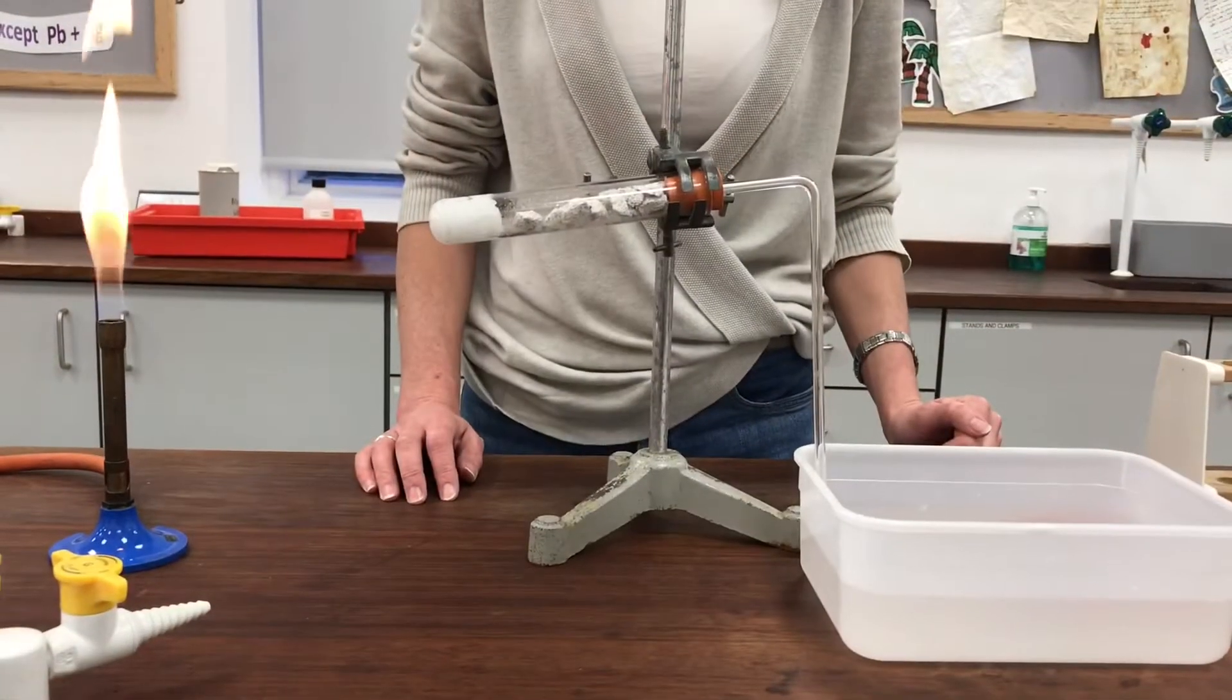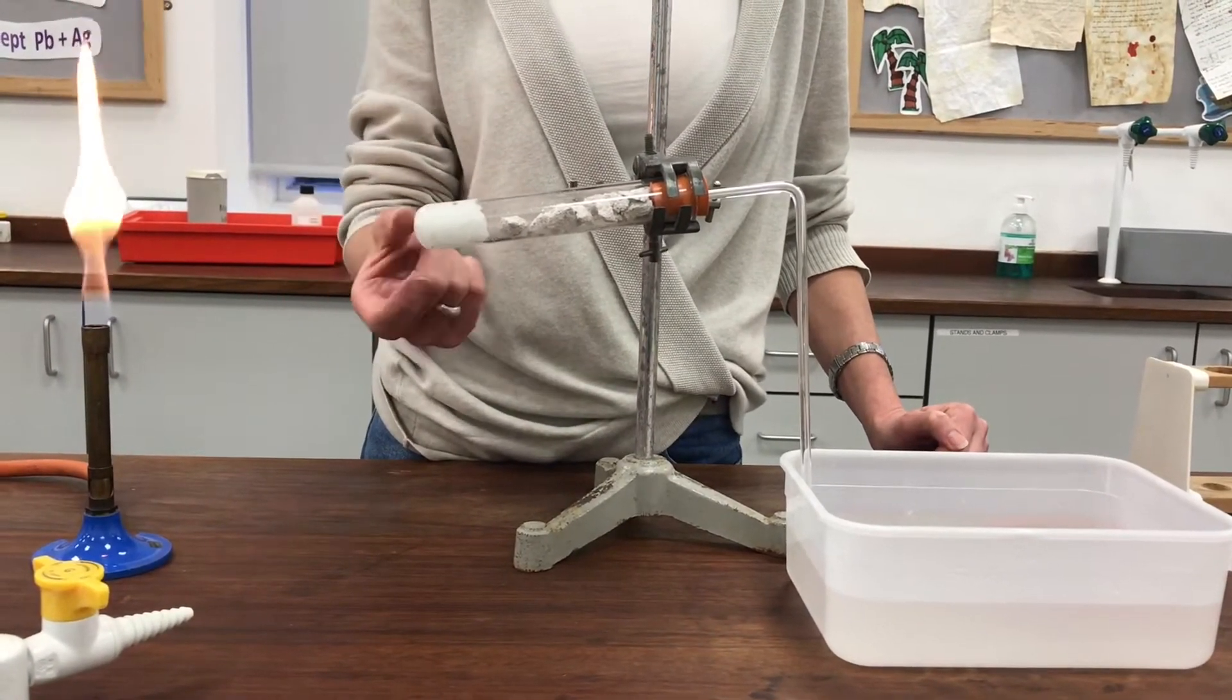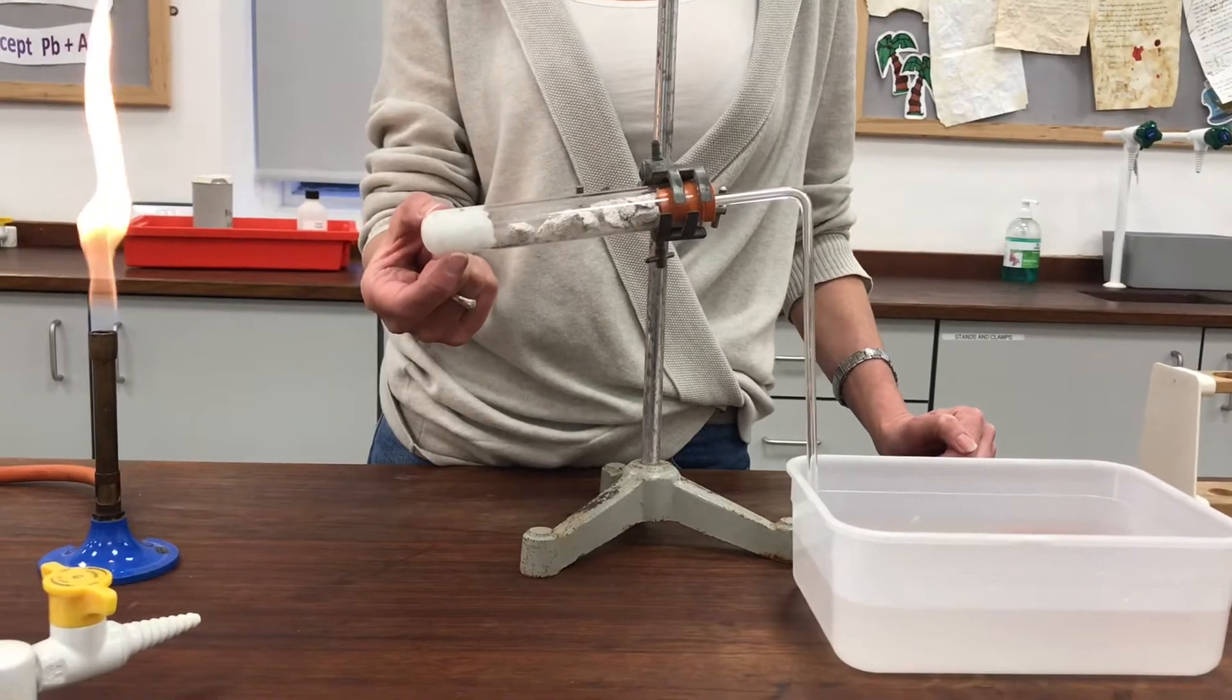This is the apparatus that we're going to be using for the experiment. I've got some mineral wool here at the end of my boiling tube and I've soaked it with paraffin, so that's my long alkane molecule.